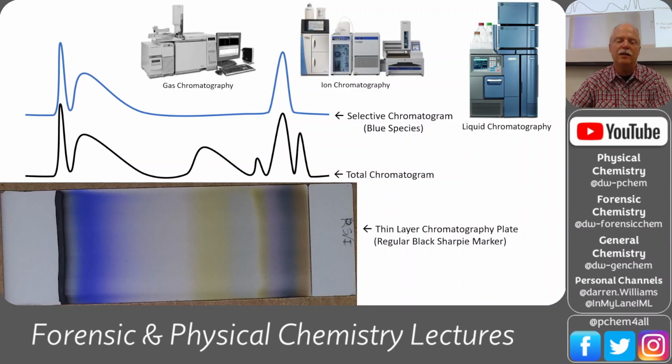So that's why GC coupled to a mass spec is the gold standard. In fact, you get two forensic credits, if you want to call it that. You've got the retention time of the compound, that's a repeatable thing related to that compound. And then you've got the mass data on that compound: its fragment patterns and its molecular ion peak.